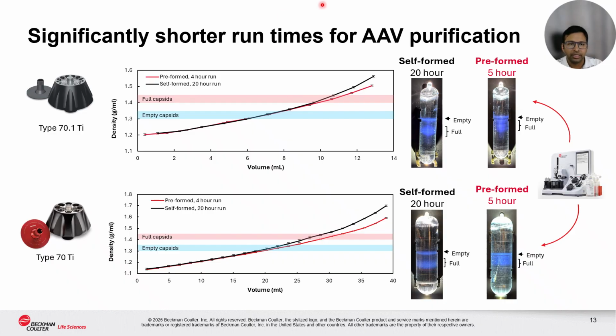The overlap is nice, but this difference is something that we will explore in a little more detail in this slide and the next slide. When we purify AAV9 particles using these density gradient parameters, and in this case we use a 5-hour ultracentrifugation just so that there is slightly better separation and resolution between the bands, there is still an observable separation between empties and fulls, though it may not exactly match up. And some of that is because of this difference that you observe.